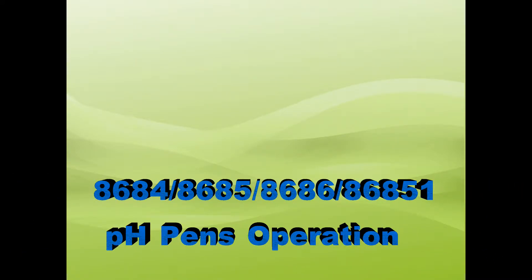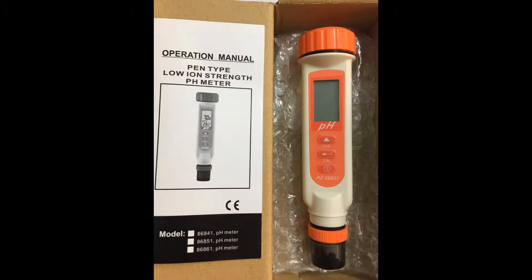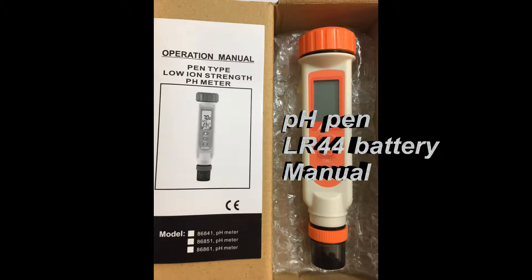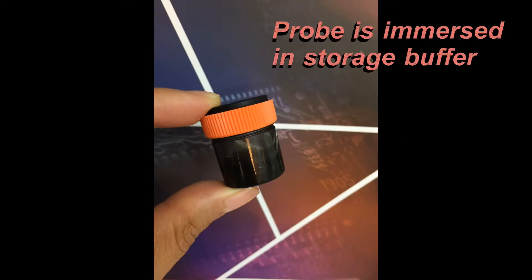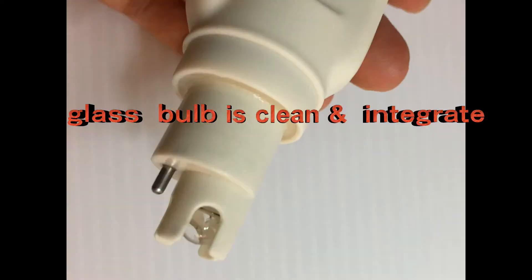AZ PH Pen Calibration, Usage and Cleanness. The PH Pen package includes 4 LR44 batteries and a manual. The PH electrode is immersed in storage buffer to avoid drying out. The PH glass bulb should be clean and intact.